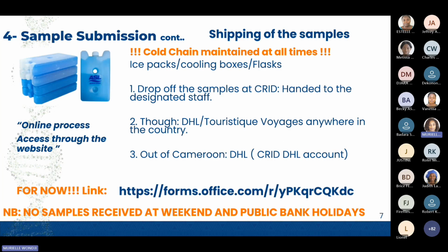Continuing the submission, when shipping the samples, make sure you respect the cold chain at all times. We really like the samples to arrive in the lab in good order so that we are able to work with good samples.